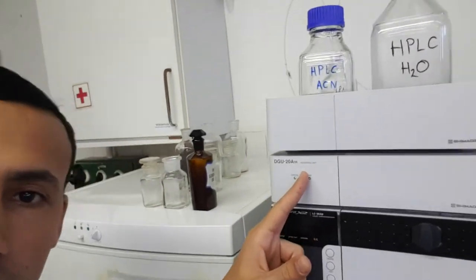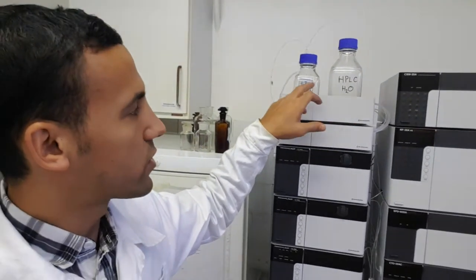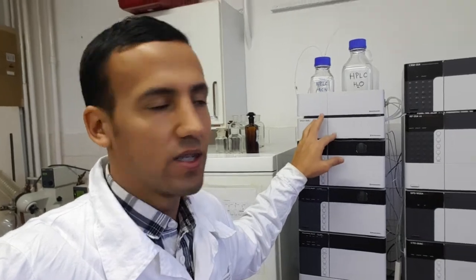I forgot to point out a very important feature: the degassing unit. You don't need to put your solvent inside a sonicator to sonicate it in order to remove the gas from your solvent. This task is done automatically by the degassing unit. So it is really fast and really practical.